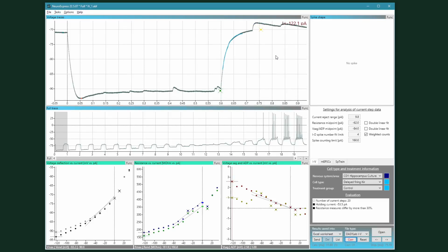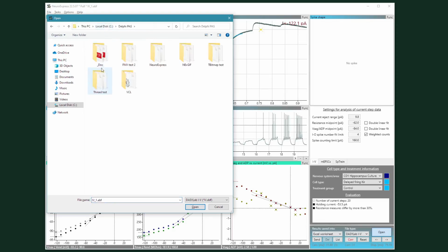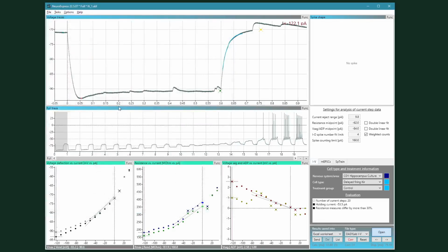The best way to get a beautiful, very clean estimation of parameters is to get rid of the EPSPs and IPSPs in your recordings, so basically you are using synaptic isolation. Just to show an example, let's see some data here.